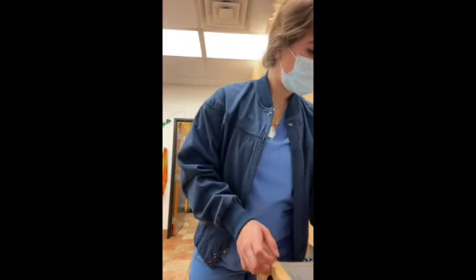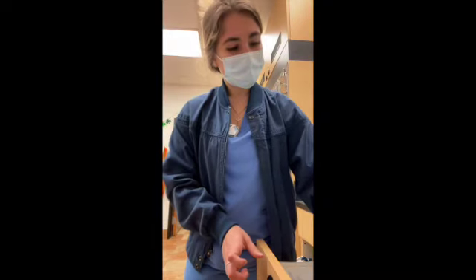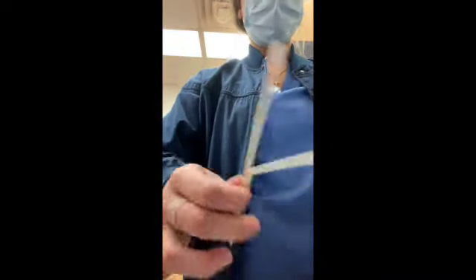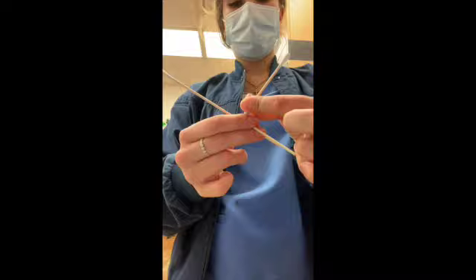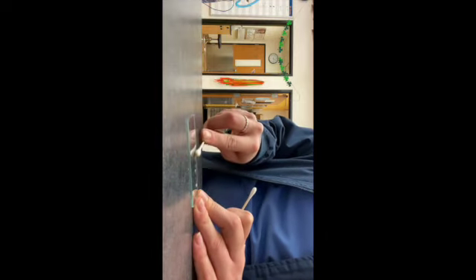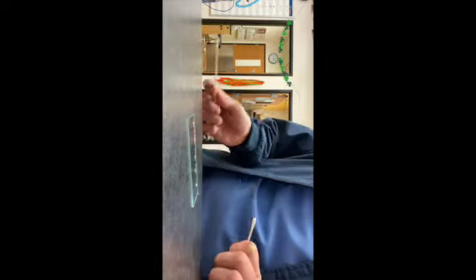Hello, we are going to do an ear swab cytology. I've already gotten my sample from the pet. Here are our two little ear swabs. One is cut in half to signify that it is our left ear, and this one will be the right. As I'm preparing it, we don't want to necessarily rub it, but just lightly roll the swab to get as much sample as we can.